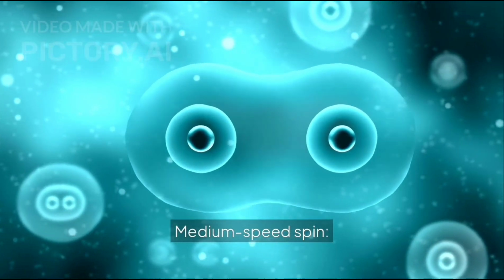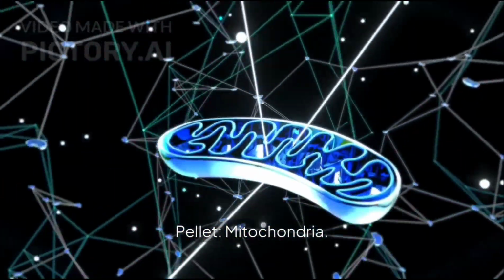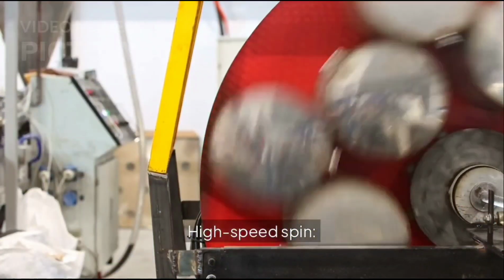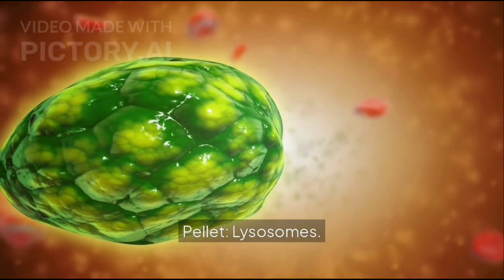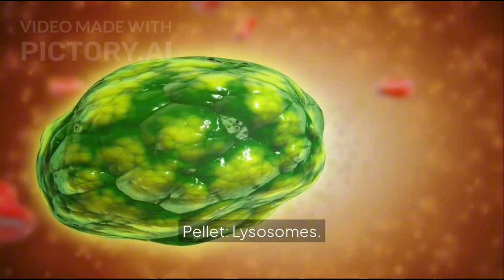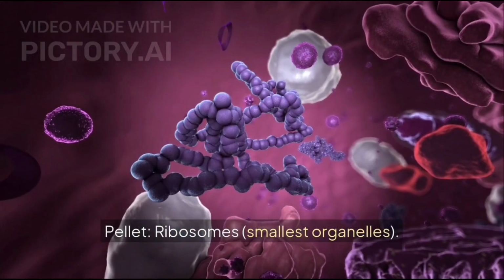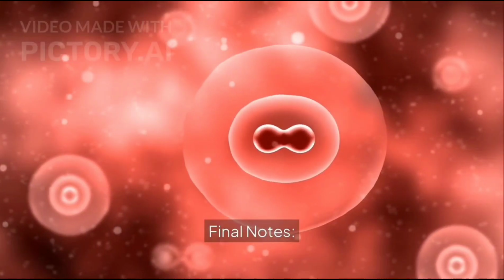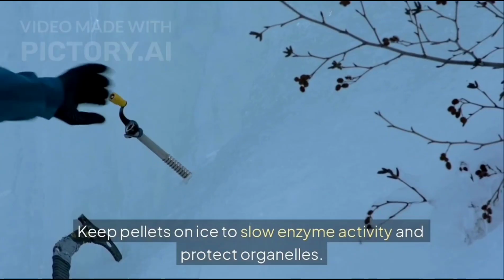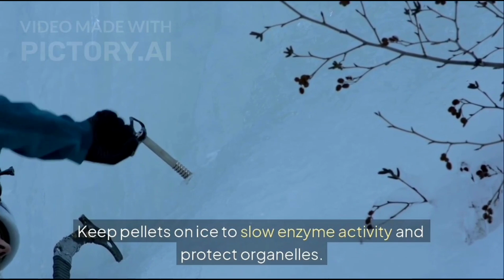Medium speed spin. Here we get mitochondria as the pellet. High speed spin. For high speed spin, we have lysosomes as the pellet. Finally, at very high speed spin, we get ribosomes, which are the smallest organelles, as the pellet. Final notes. Keep pellets on ice to slow enzyme activity and protect cell organelles.